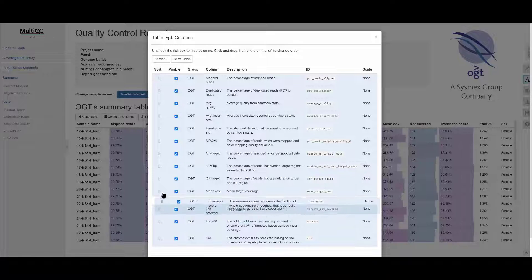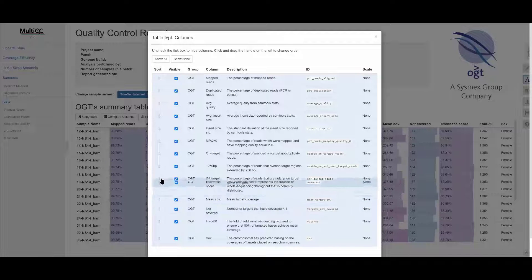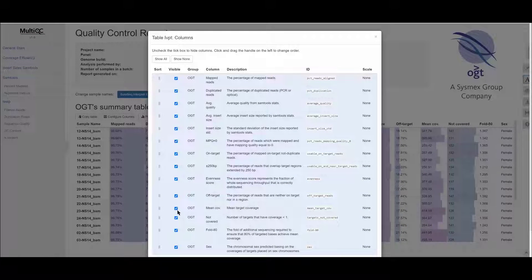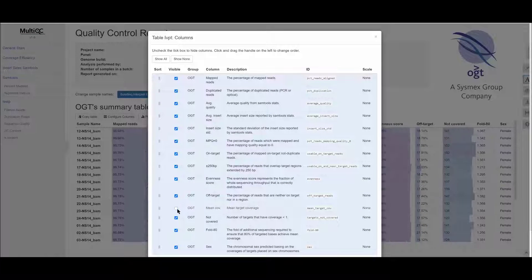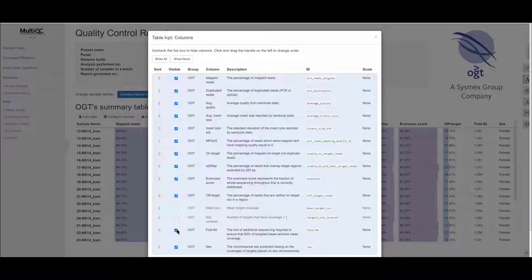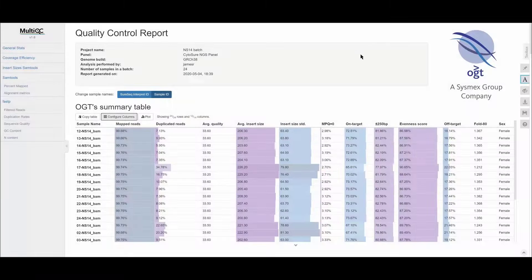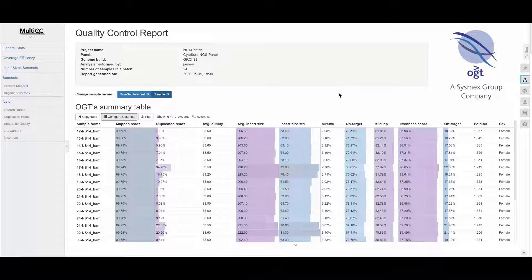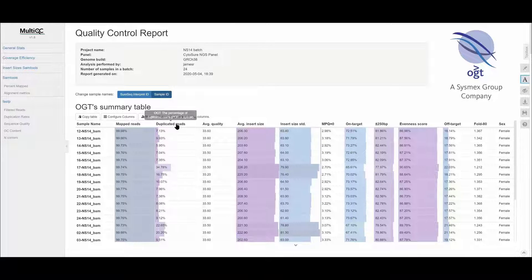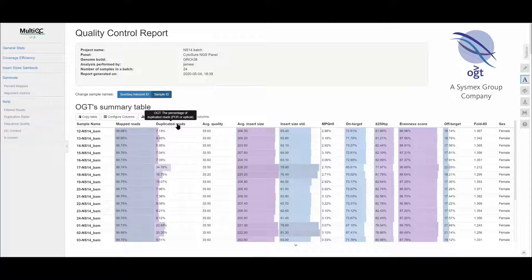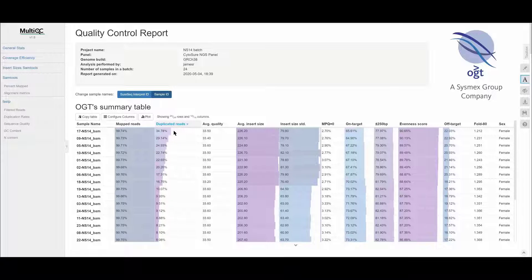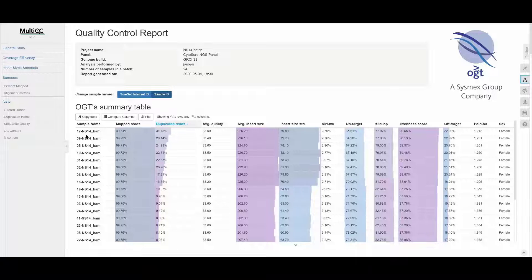And then changing things around by dragging and dropping or by unchecking the tick boxes. You can also sort this table using the column headers in ascending or descending order. So for example, you might want to see if a sample in your run has a high number of duplicated reads, so you could sort this to the top.